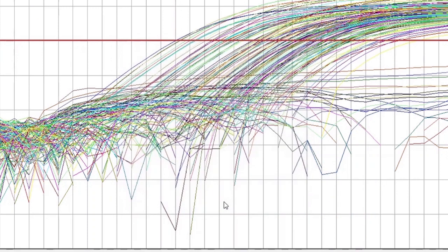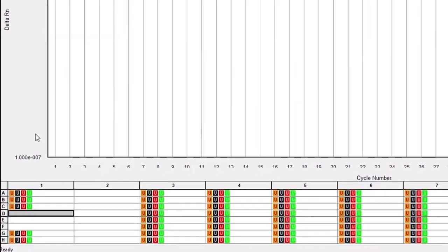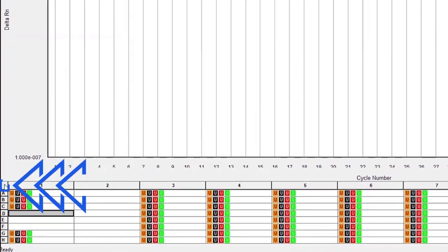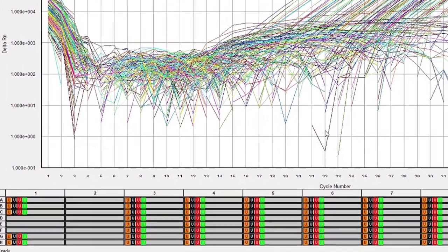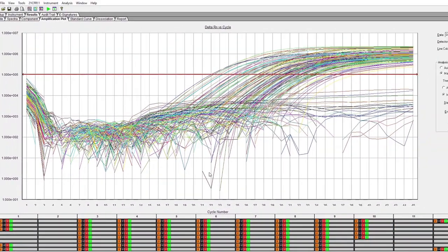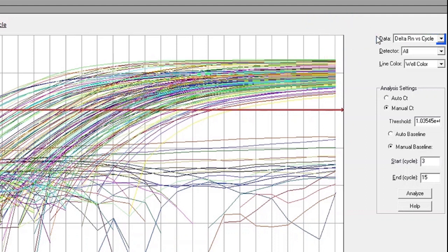To analyze the data, start by highlighting all the sample wells from the run. Click on the upper left box of the sample wells, and all of the amplification curves will appear on the graph. On the right side of the window, ensure that the data drop-down selection is set to Delta RN versus Cycle.